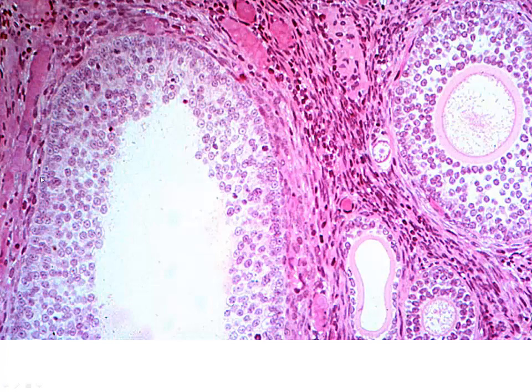Here we have another example of an atretic follicle. This helps you distinguish even better the pycnotic nuclei, the really dark, dark spots that you see here. And again, you can see the loosening of the granulosal cells. Here we have an atretic follicle. Here we have a multilaminar follicle.